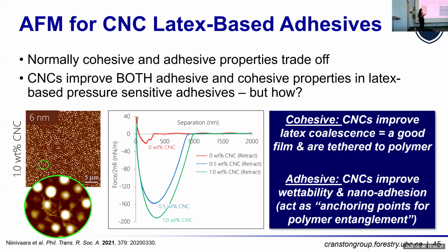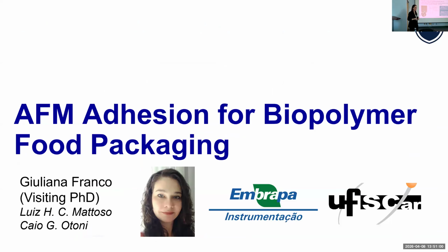But then to measure the adhesion, we went to force curves. Everything's below 0, so this is attractive adhesive forces. And in short, as you add more CNCs, you get more adhesion because the nanoparticles act like anchoring points and the polymers get tangled around and hold everything together. So we could really use AFM to explore this a little bit further rather than just saying, yeah, they work.